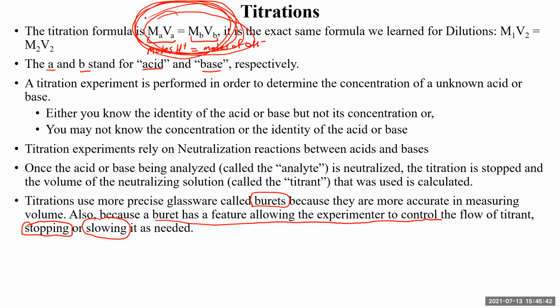The second titration then, since you know when you're getting close, you can slow down the dispensation of your titrant solution into the analyte. You can slow it down as you get closer to your equivalence point so that you don't risk overshooting it. A burette actually allows you to slow down the flow of solution down to maybe 1 drop a second, 1 drop every 20 seconds.